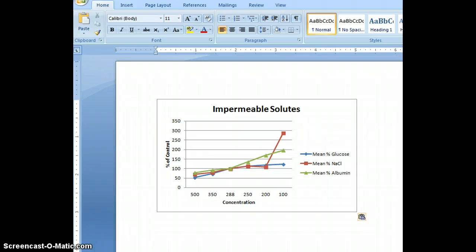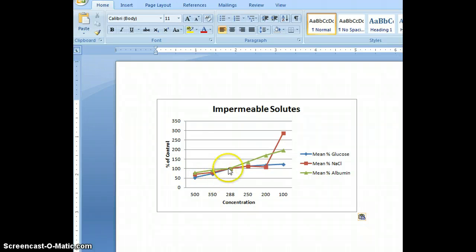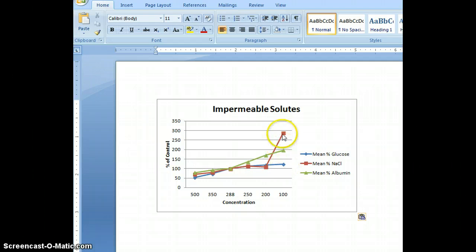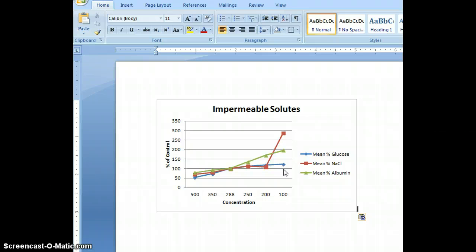Now we're going to do our stats. It's called an Analysis of Variance, or ANOVA. We're seeing how far these three points are varying from these three points — and from these, and these, and these. Just judging by how far those are apart, I'm guessing we're going to get a significant result on our ANOVA, which would indicate a p-value of less than 0.05.